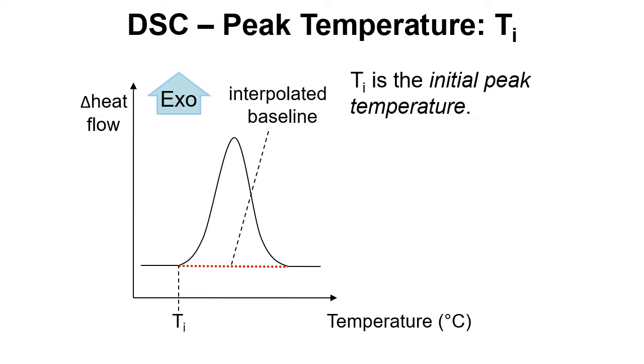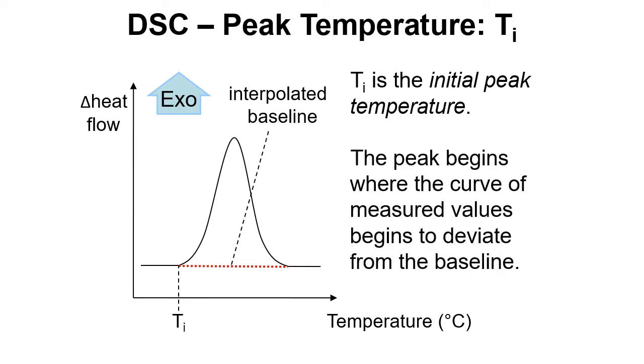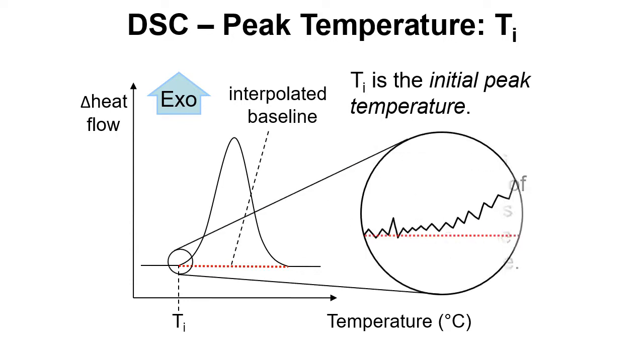This is the initial peak temperature so this is where the peak just starts. The peak begins where the curve measured values begins to deviate from the baseline. But if we zoom in on this it won't just be a nice smooth line. There will be some noise in this and it can be a little bit problematic to decide where the baseline should go. Which portion of this do we take? We would need to average a bit of this and say well that's going to be the baseline, but do we average this bit or do we average a bit more of it? And then how do we decide when this has left the baseline? Do we decide based on a number of standard deviations above and below for the part that we've averaged? So there's a number of questions here. It can be difficult to get reproducible results with this.